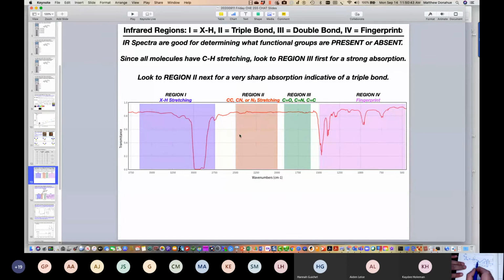So we looked at this and said, okay, we recognize there's OH, there's a carbonyl, that's an acid. Look at this one now. This is 212. When you look at that, what do you immediately think? It looks like the first one we did at the beginning, which we said was an alcohol, right?